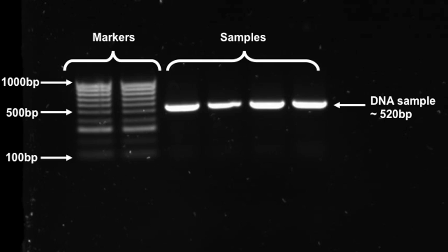The DNA bands are now visualized by UV illumination, showing bright bands indicating the presence of a DNA fragment. The gel image can then be recorded for further analysis.